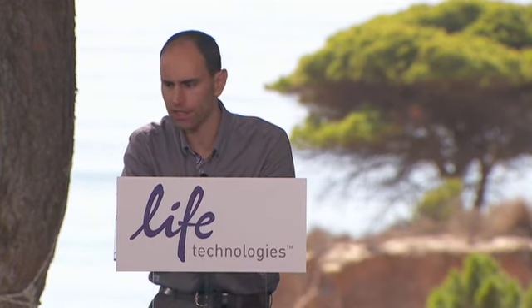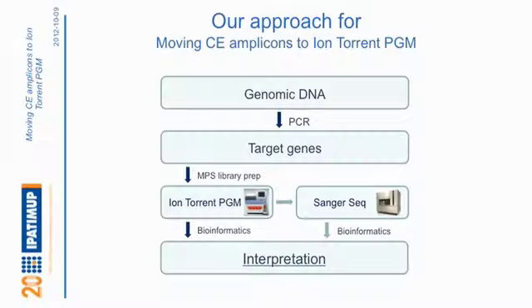Amplicons that are missed during the amplification are also validated using Sanger sequencing. And just to give you a number, this represents around 1.6 Sanger sequences that one needs to do per sample, which is relatively very low. So I think this clearly points a way that for us was simple, practical, and I think it's a valid approach for this type of study.